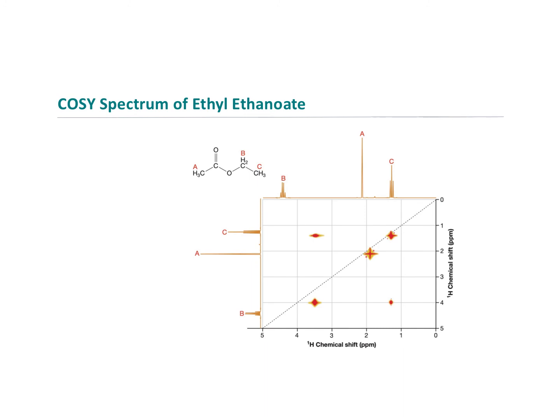Now, this is a 2D NMR spectrum, and there are two frequency axes, an x and y axis, right? So we see here there's your x, and that's the chemical shift, and then here's the chemical shift here. And then we can see the z-axis, and that corresponds to amplitude, okay?